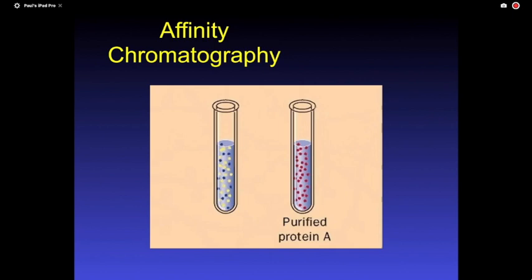At the end, do I have purified protein A, as they say, in this test tube? No. You have the protein plus that small molecule. What could you do to get a pure protein? You can either do size exclusion, because that small molecule is much smaller than your protein, or two, you can do dialysis.